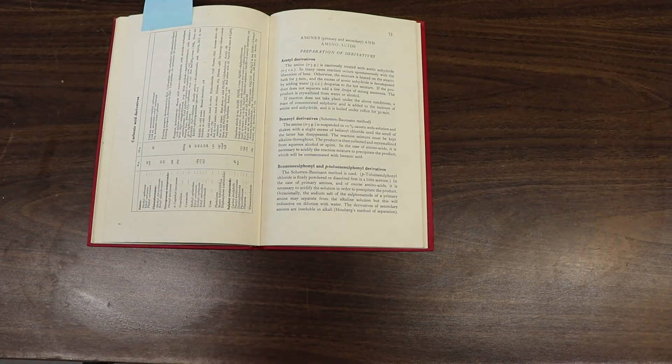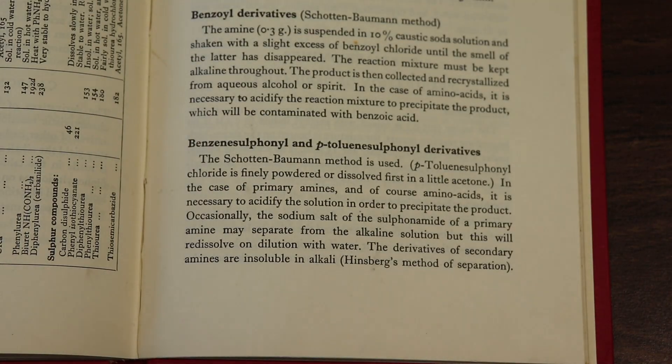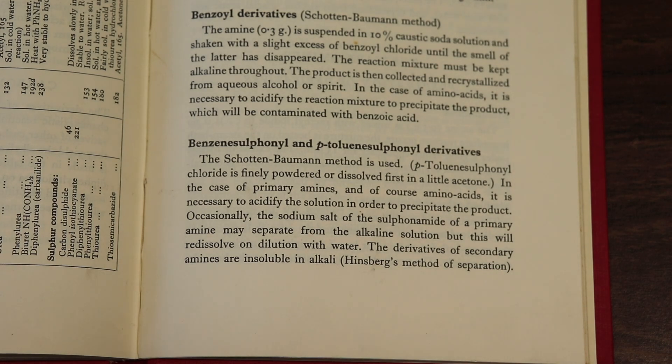This necessitated another way to get evidence for the identification of our product as morpholine. I thought the easiest way would be to make a derivative of morpholine and then measure the melting point of that. For the preparation of the derivative, I employed a modified Hinsberg test.